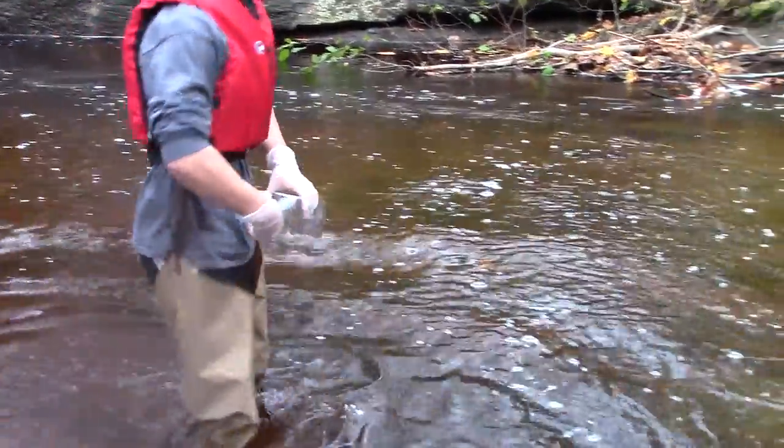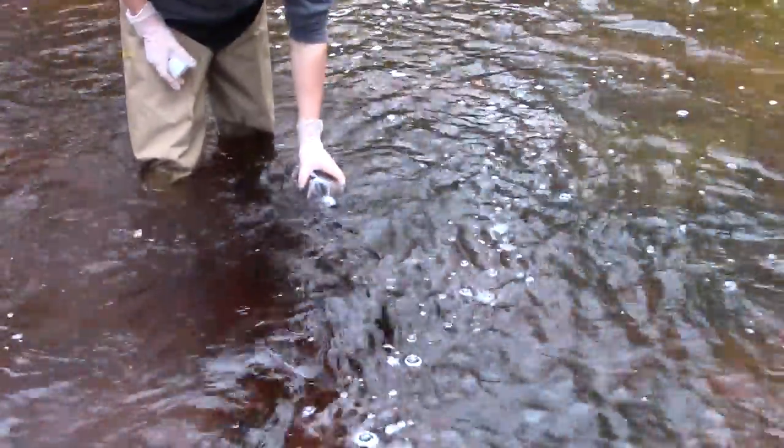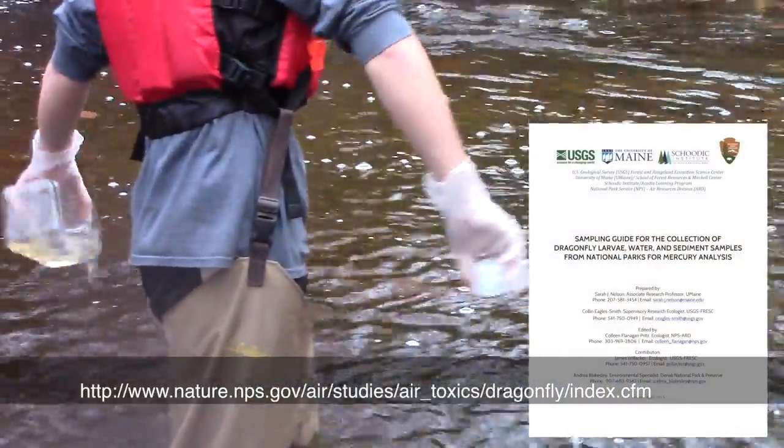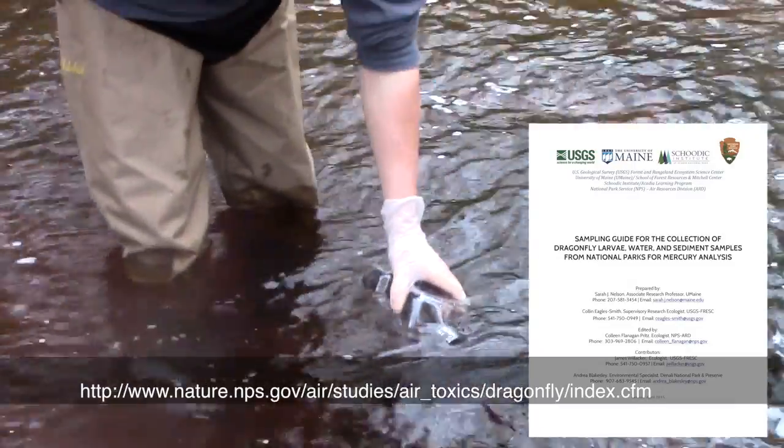To collect samples that don't get contaminated means following protocols and keeping everything ultra clean. This video supports the sampling guide for the collection of dragonfly larvae, water and sediment samples from national parks for mercury analysis.